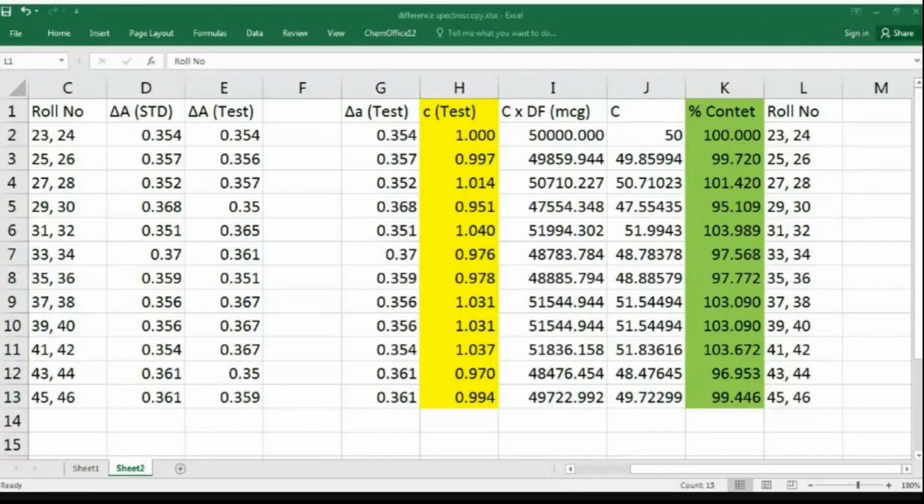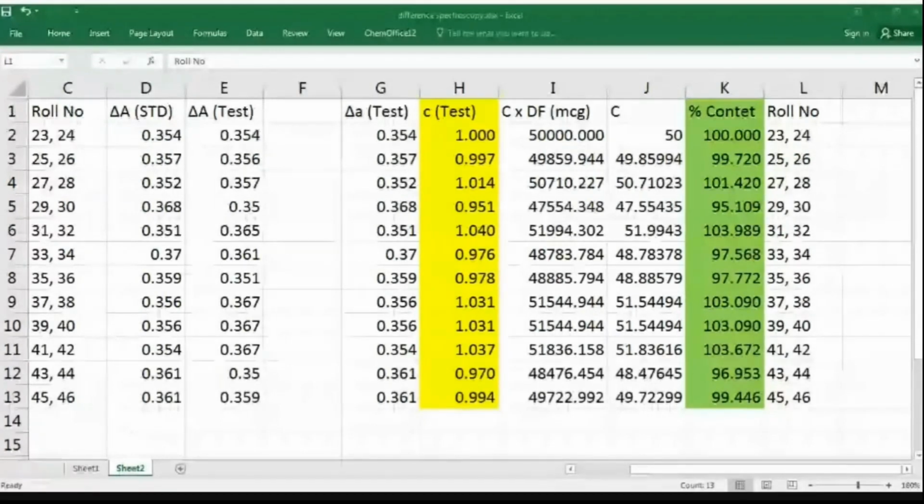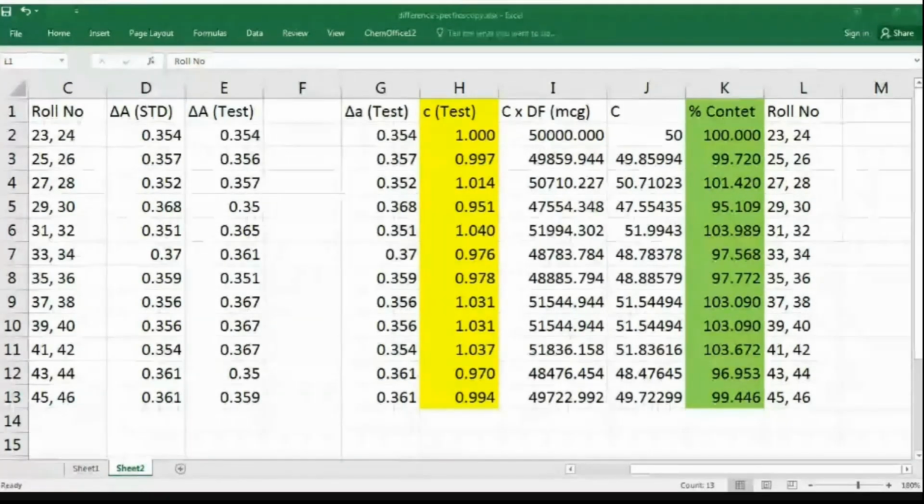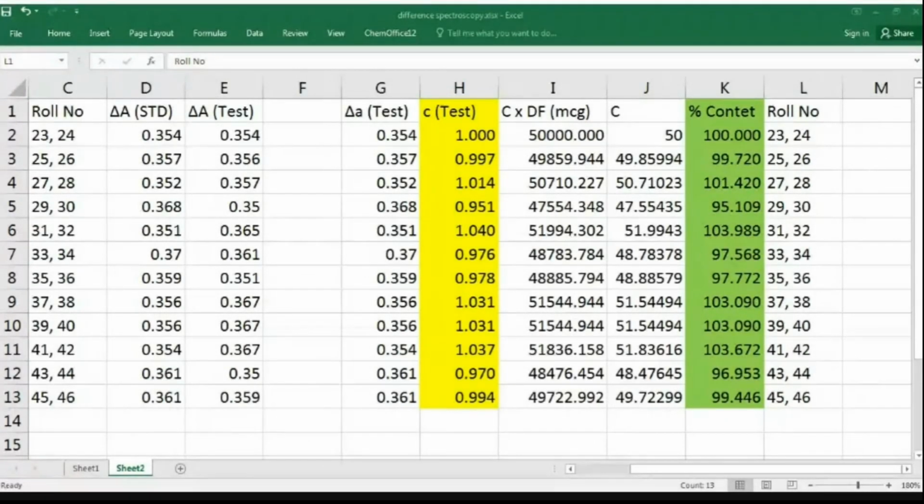Okay, right? Look, I will tell you what happens. Anyway, I will explain to you what this method is. See, just consider any compound. Okay, any compound. We are using paracetamol. Paracetamol has some impurities. We are preparing one solution in methanol. So in methanol, the observed value of absorbance is for paracetamol plus impurities present in paracetamol. You agree with this part? What we observe is absorbance of paracetamol plus impurities present in paracetamol.